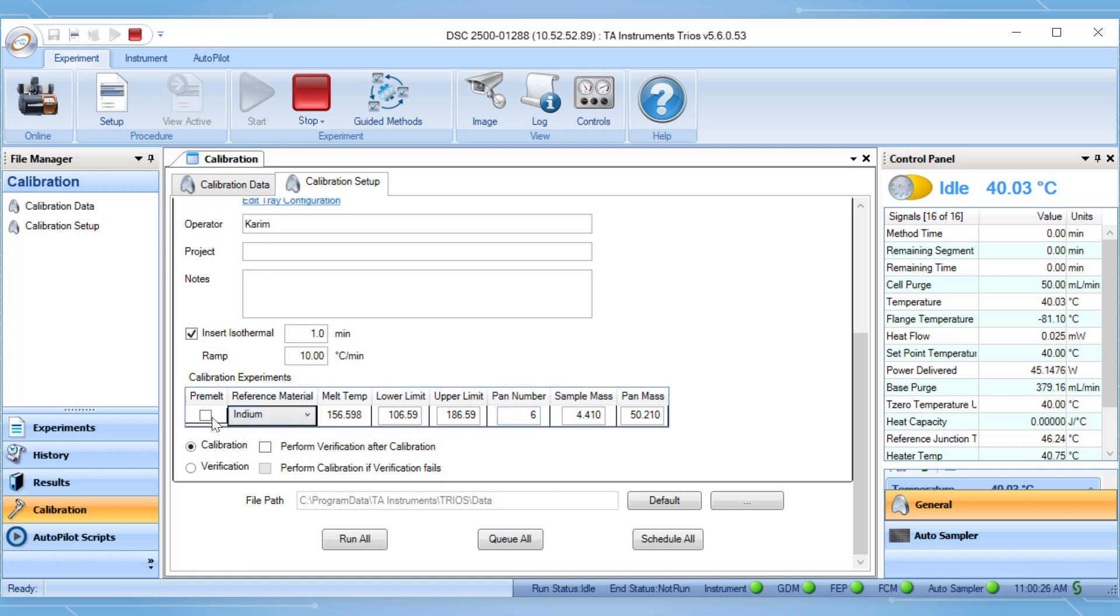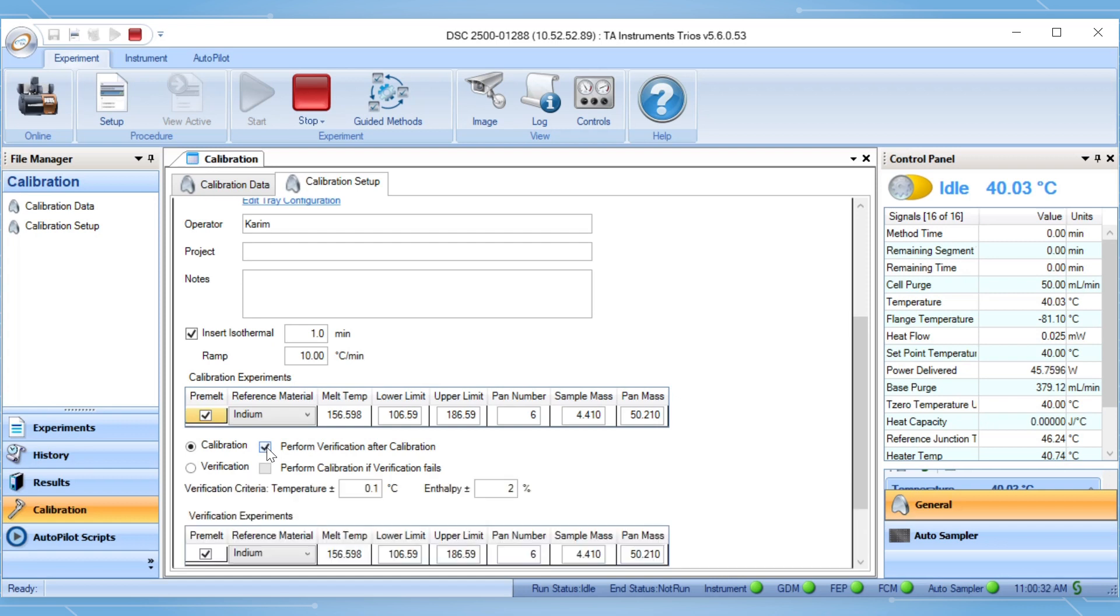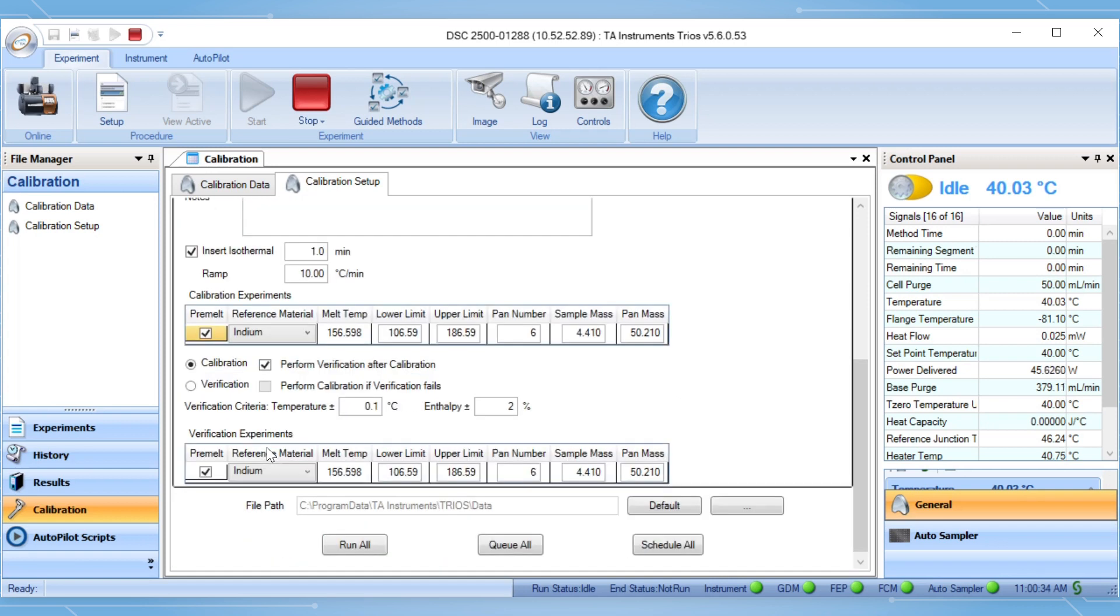If using a new indium sample, check the box beside the pre-melt. Check the box beside perform verification to have a verification run after calibration. You can use the same indium sample used in calibration.